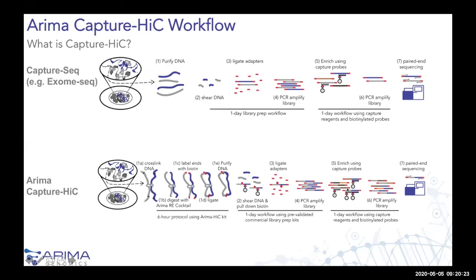your biotinylated probes and you enrich for any sequence element of interest that you're interested in probing for the 3D landscape. So you can imagine if you want to capture promoters and all of the distal elements that interact with promoters, you would do an experiment where you enrich the Hi-C library for promoter sequences. And we've been partnering with Agilent Technologies over the past year to try to streamline this Hi-C plus capture sequencing protocol, and been using their probes, hybridization reagents, and probe design software suite.